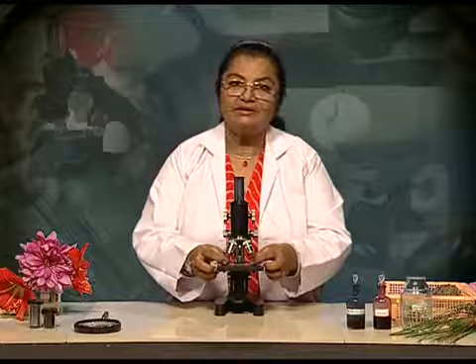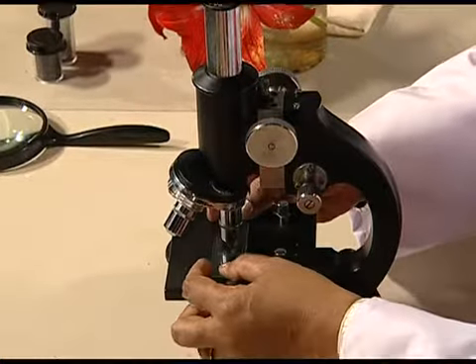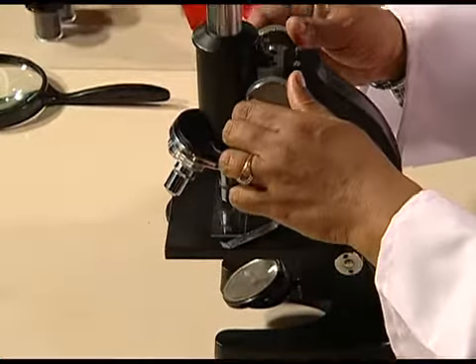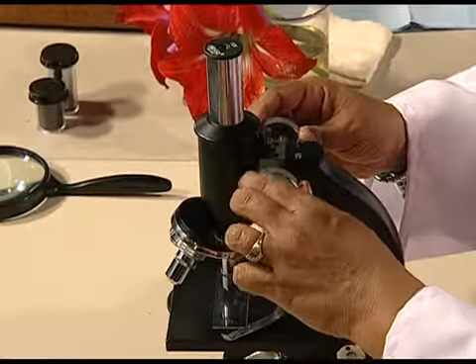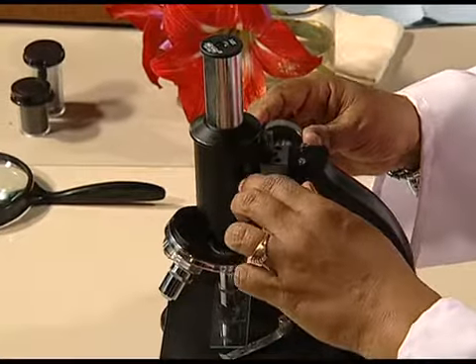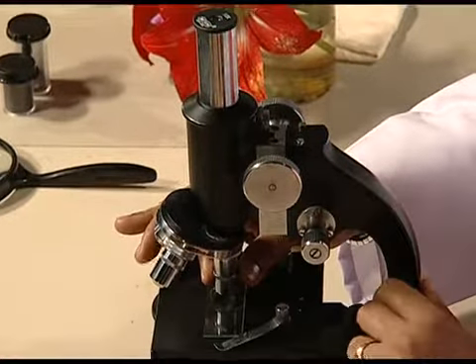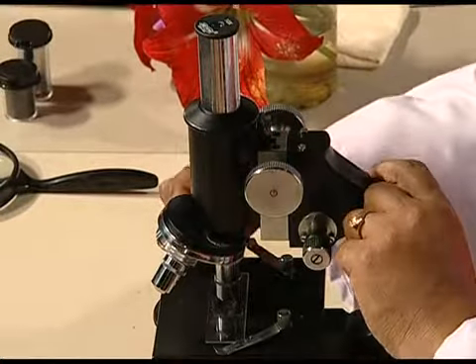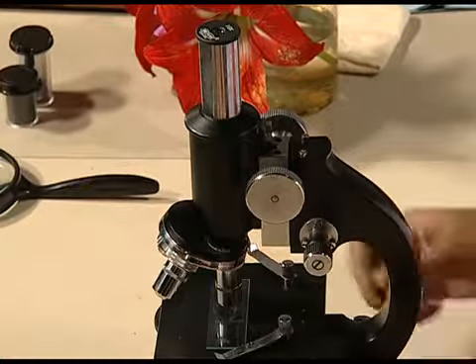When your slide is set at high power objective lens, never use the coarse focus knob, because if you use it, the lens can get damaged or the slide may break if you ram the lens into the slide.